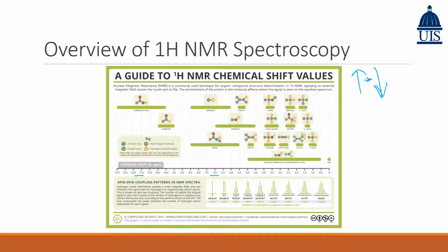Okay, so in addition to this, what it'll also tell us is what's called the spin-spin coupling pattern. If we take a molecule, say, like this, let's make it easy, and each one has one hydrogen. By the way, this is measuring when the hydrogens flip, specifically the hydrogens. So let's say it's our molecule that's like this. And hydrogens themselves have a magnetic field that influences each other. So let's say if we're thinking about this one here, this hydrogen is going to influence.